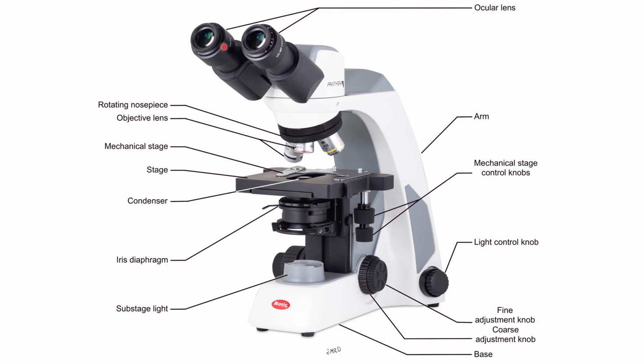The reason is, in each of these ocular lenses, one will be clear, there'll be nothing in it, and in the other one, depending on the class you're in, our class, we have a pointer, so you can rotate the pointer to the objects and you can say, hey, Miss C, what the heck am I looking at? When you get to micro, some of them will have an actual measuring tool in there for measuring the size of the bacteria. These have a magnification of 10x.